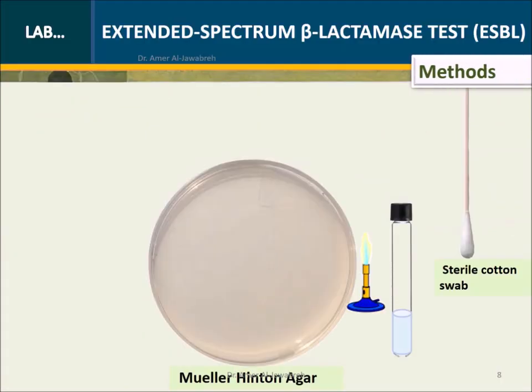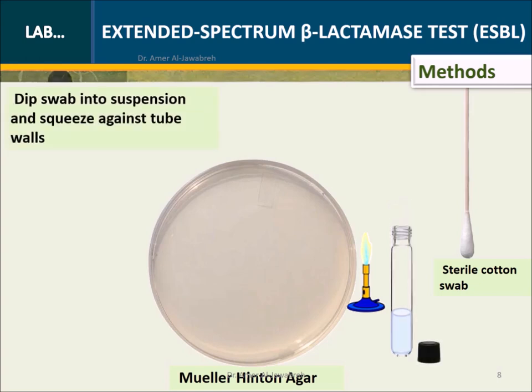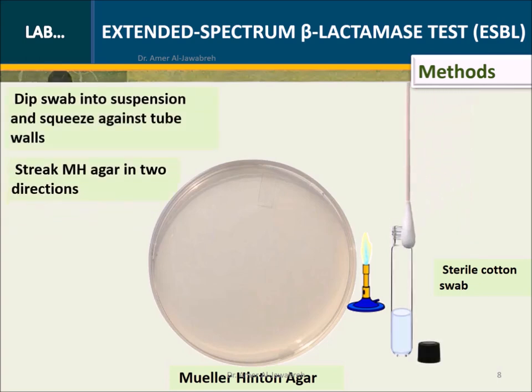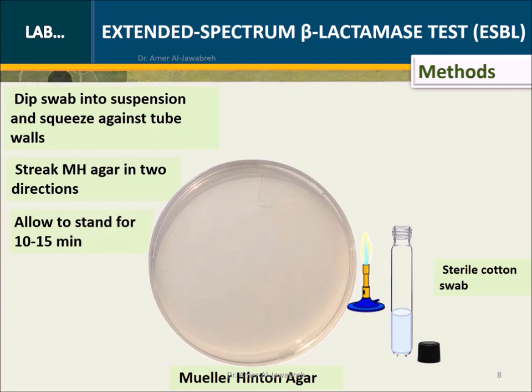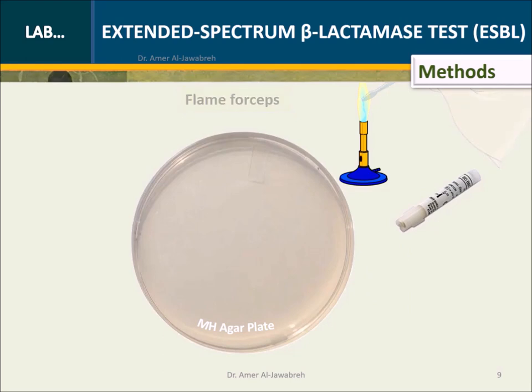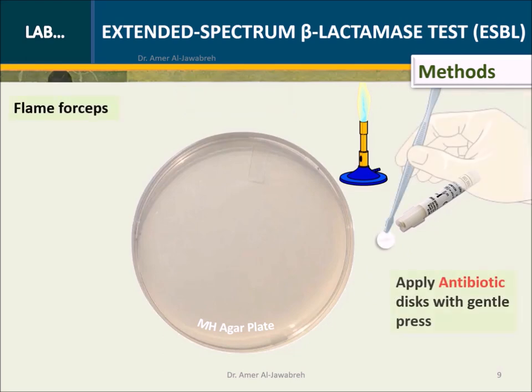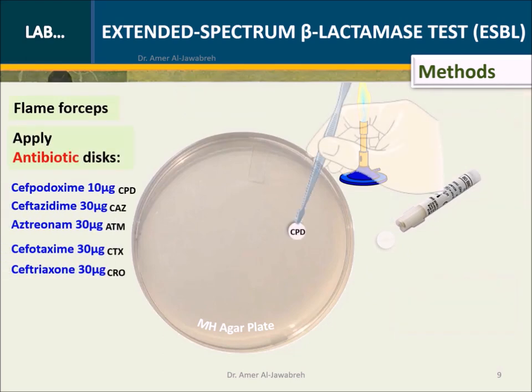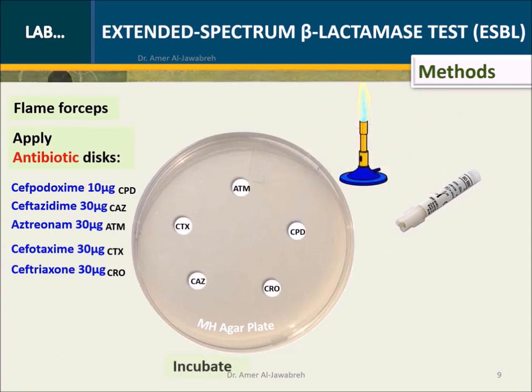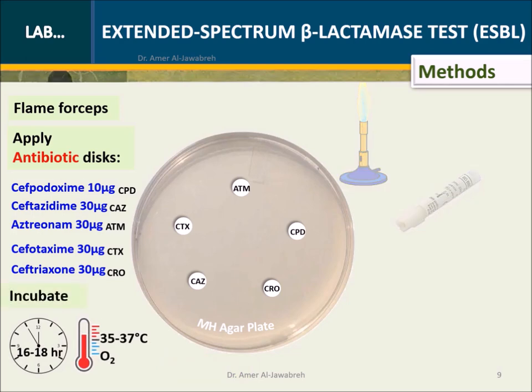Screening test method: dip swab into the suspension and squeeze against tube walls, then streak Mueller-Hinton agar in two directions. Allow to stand for 10 to 15 minutes. Under aseptic technique, apply the appropriate discs and press gently.